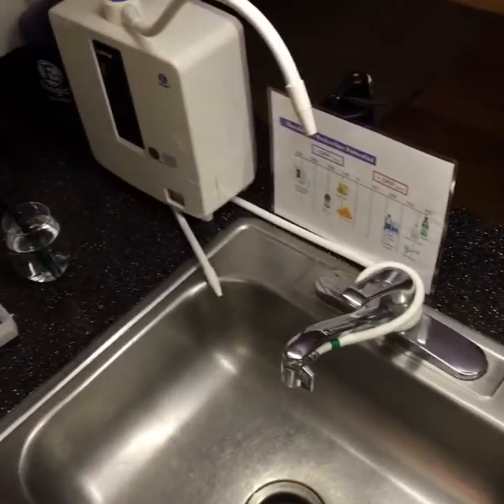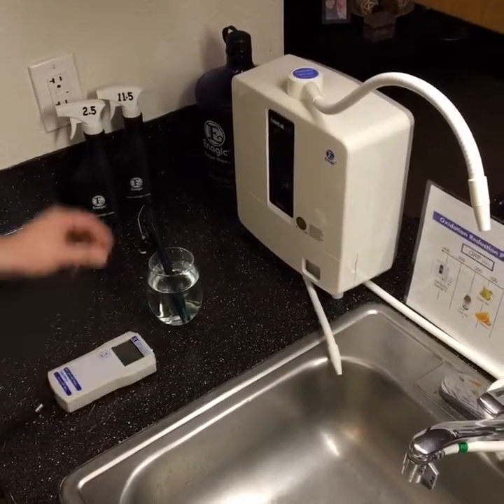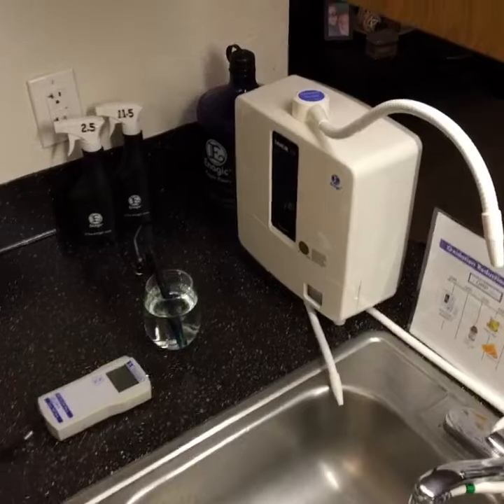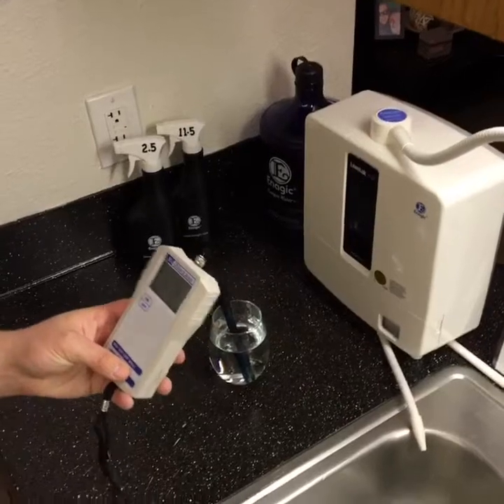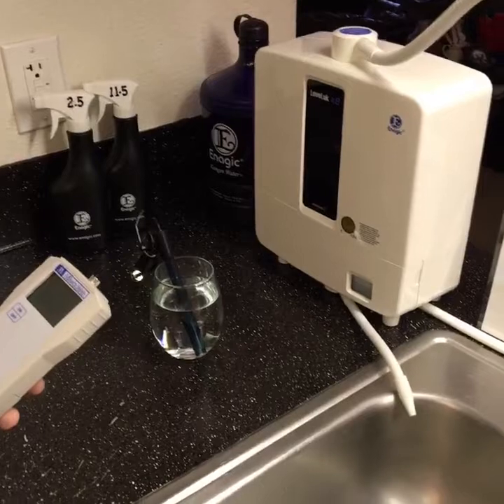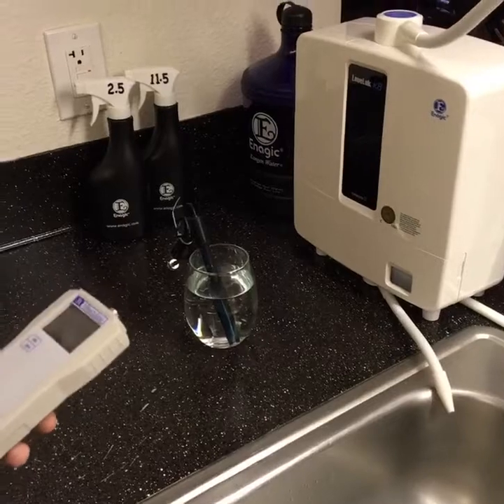This is how you properly calibrate — or more accurately, activate — your ORP meter. It's already factory calibrated, but this is how you reset and keep it ready. This is definitely a great meter for testing any type of antioxidant-rich water or conventional water, which will show a positive ORP — oxidizing, aging, rusting. Hope you guys are having a great day.